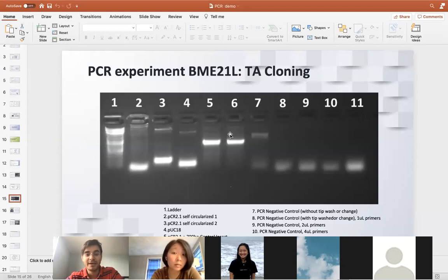Let me ask you the way that I think about this. If this was a band that amplified COVID material, do you see the letters here? It's a weird question. No, but they should be there.